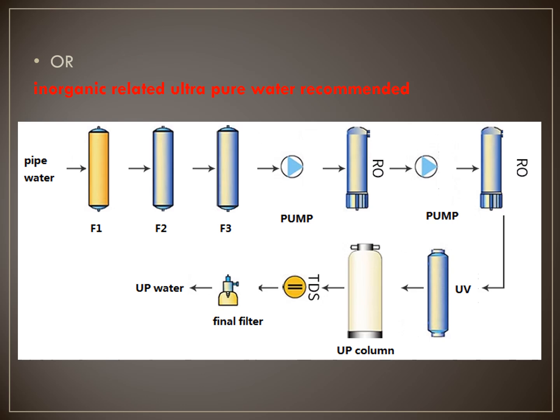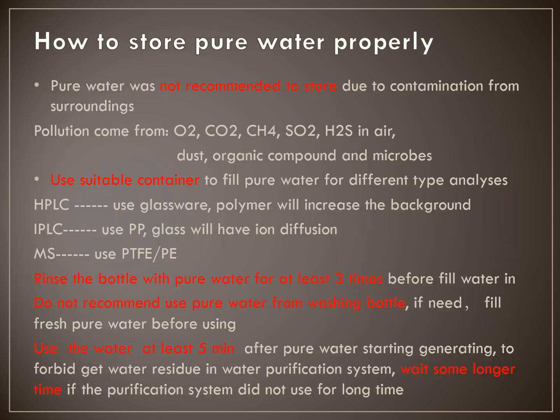The ultra pure water is too pure, so how to store the pure water becomes a problem. We don't recommend you store the pure water in any container because the water is too pure.